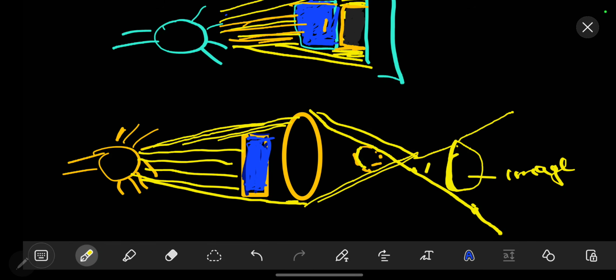Now you can see that this is dark. Even the background is dark. So that's why there is a dark background against a light image. So the image is light. This is simply because light is passing through the image.